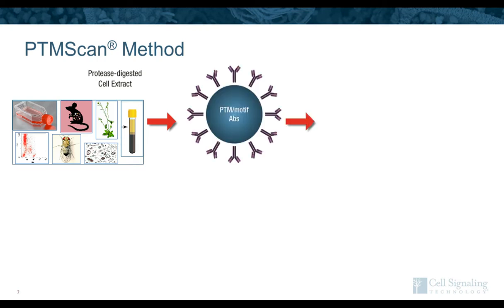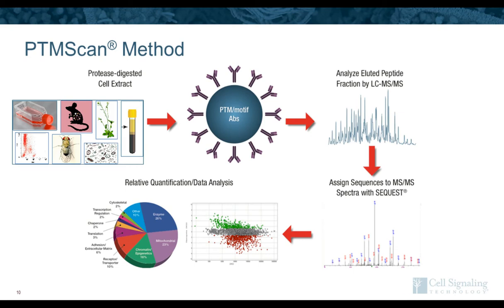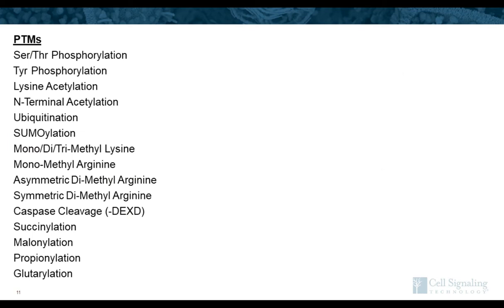So we then enrich with one of those specialized antibodies, take that enriched material and run it in mass spec to get identification of our peptides, and then we can do quantification, looking at what's up and what's down across the various samples. And we're able to assay a lot of different PTMs using this method, things like phosphorylation, acetylation, methylation, other lysine acyl modifications. And I wanted to tell a brief story today about two of these in particular, ubiquitination and succinylation.